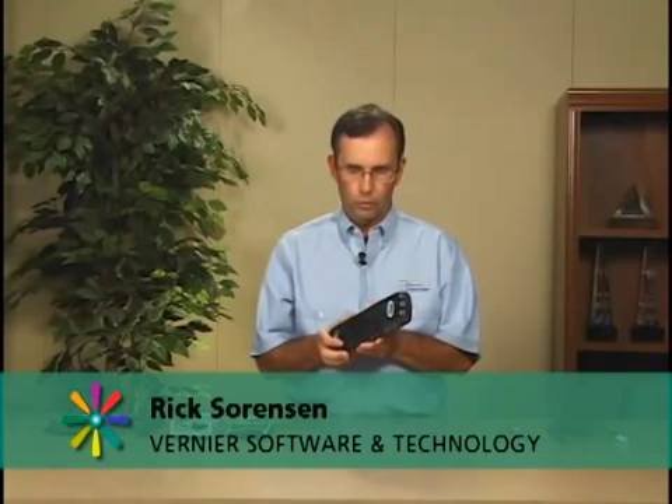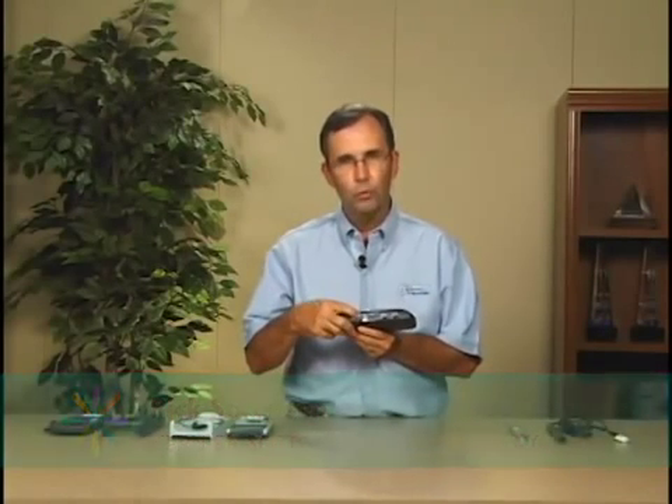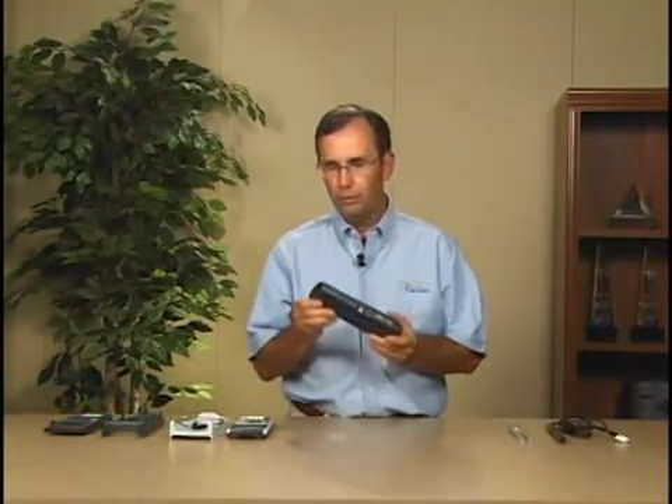This is the LabPro interface. LabPro can be used with the computer through the USB port. It can also be used to collect data with a graphing calculator through the calculator port on the bottom. It supports all TI graphing calculators.